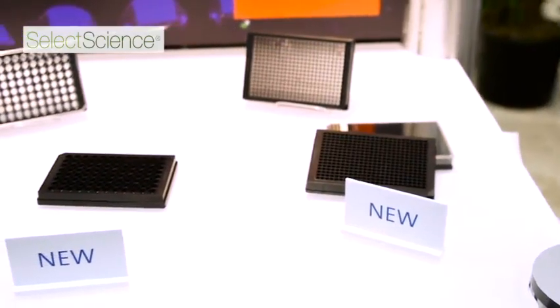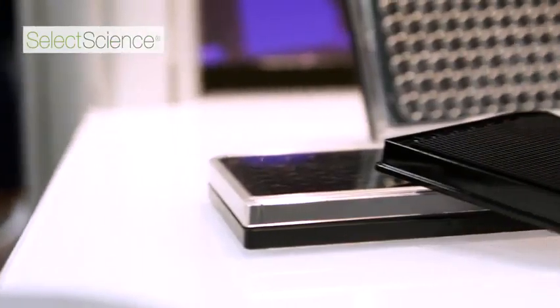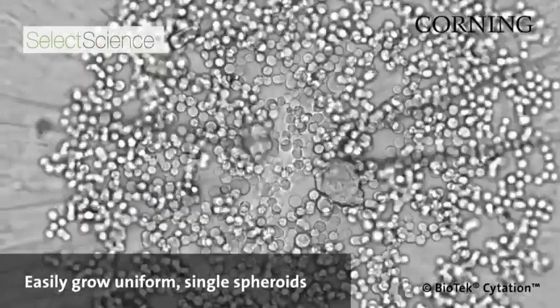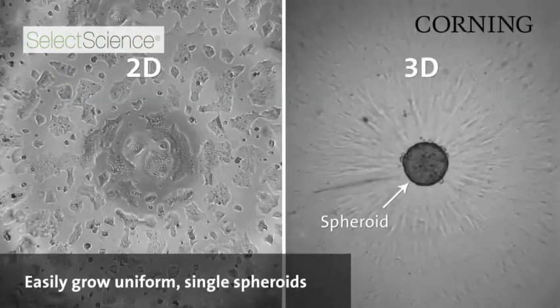We've identified the spheroid microplates as a technology that we want to work with for a number of different reasons. The plates use a clear bottom which allows us to not only perform microplate reading but also imaging to see the spheroids.